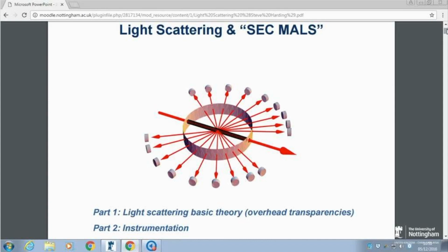It's a way of characterizing molecular weights, molecular weight distributions, and conformations of molecules above a molecular weight of 2,000–3,000 and up to several million, including antibodies and including glycovaccines, including excipients, all this sort of stuff. This is a very popular method now.